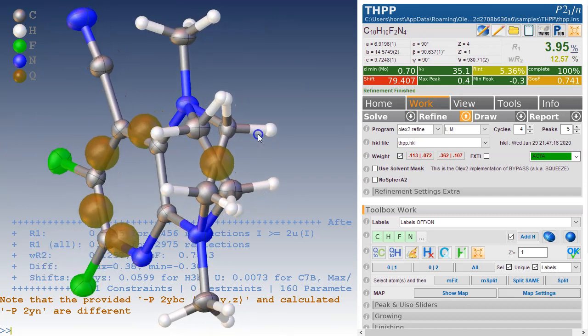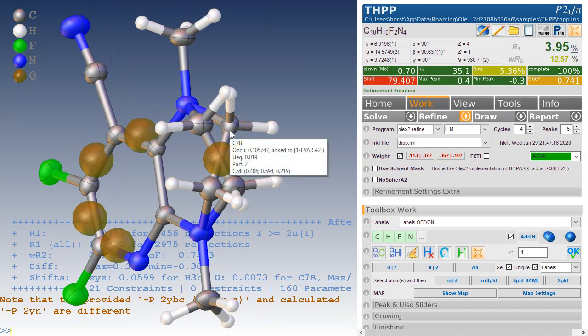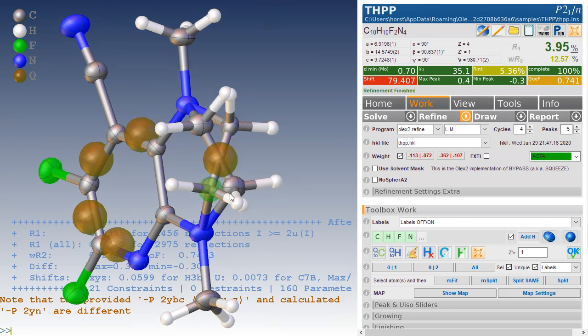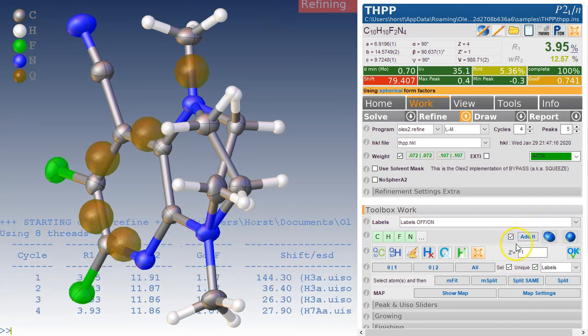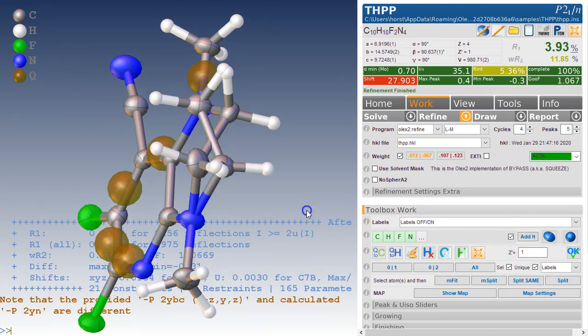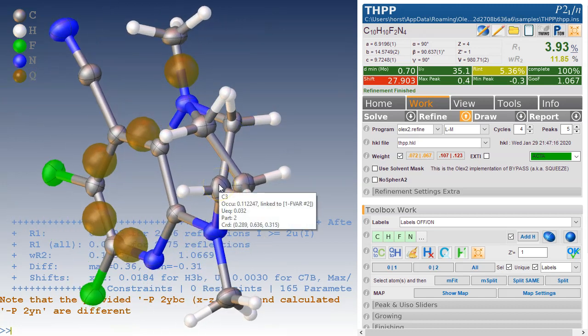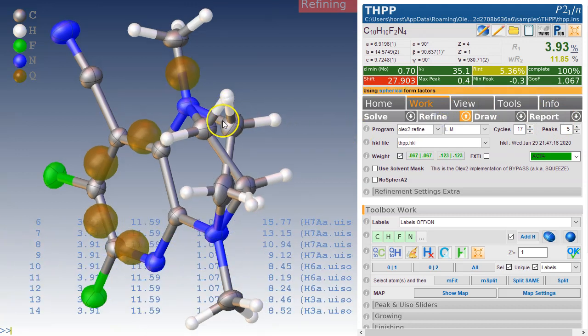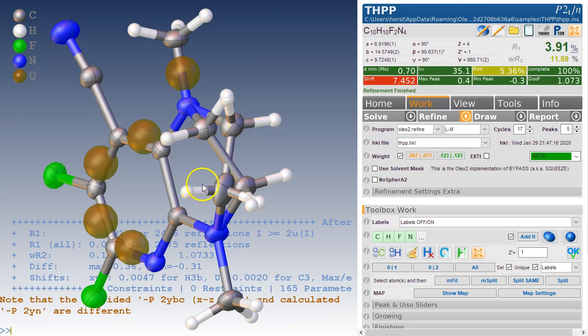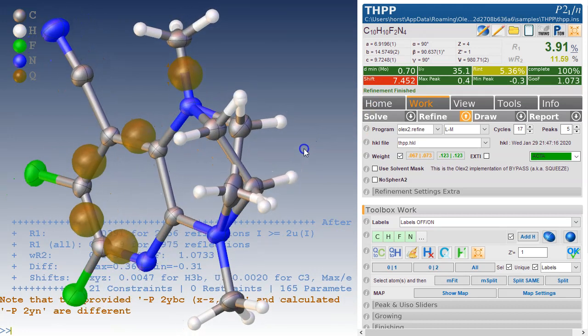Now the ADPs don't look entirely reasonable here, but then don't forget this is only 10% of a carbon now. So let's make this one anisotropic as well. We can select it and then click on this, that makes it anisotropic, and because this box is ticked it straight away refines. And they don't look particularly good, but then again as I said before, this is only 10-11% of a carbon. So we can now refine using Levenberg-Marquardt, make it a few more cycles, and refine that. And see what happens. So this is all moving and now it's moving away a little bit, so we probably will need some restraints here.